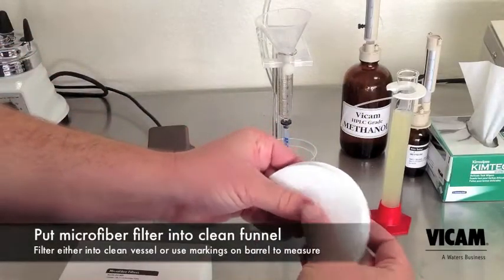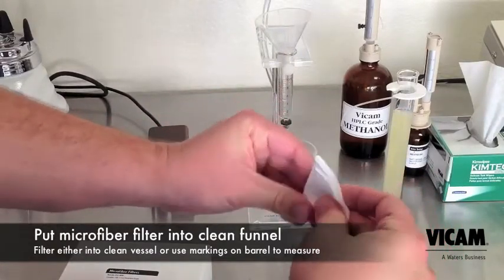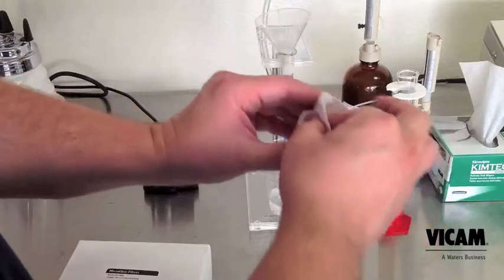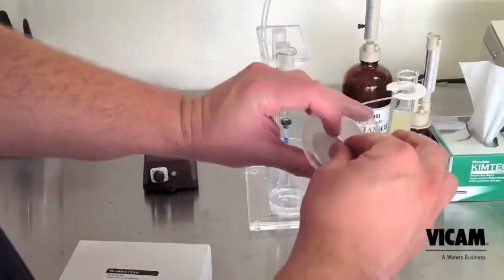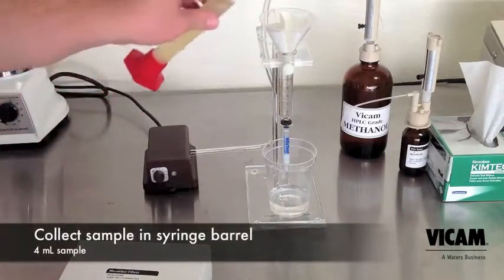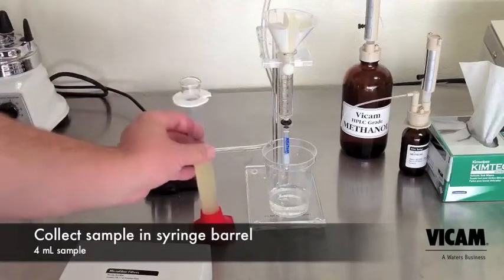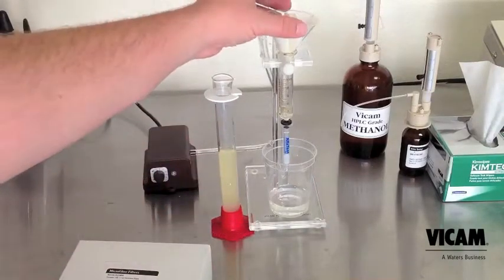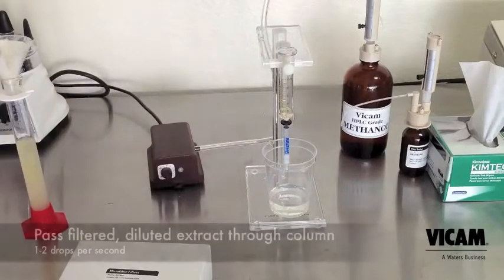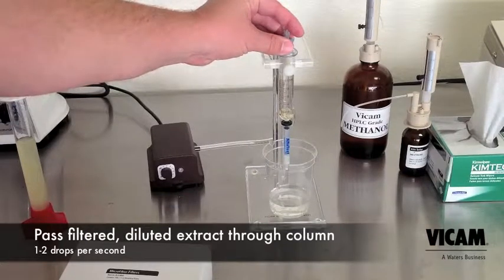Fold a microfiber filter to fit in the funnel. The folding technique shown allows maximum surface area for the filtration, but any way you fold it is just fine. Using the markings on the syringe barrel to measure, pour 4 milliliters of diluted sample through the filter into the syringe. Attach the air pump to the top of the syringe and carefully adjust to get one to two drops of sample through the column per second.